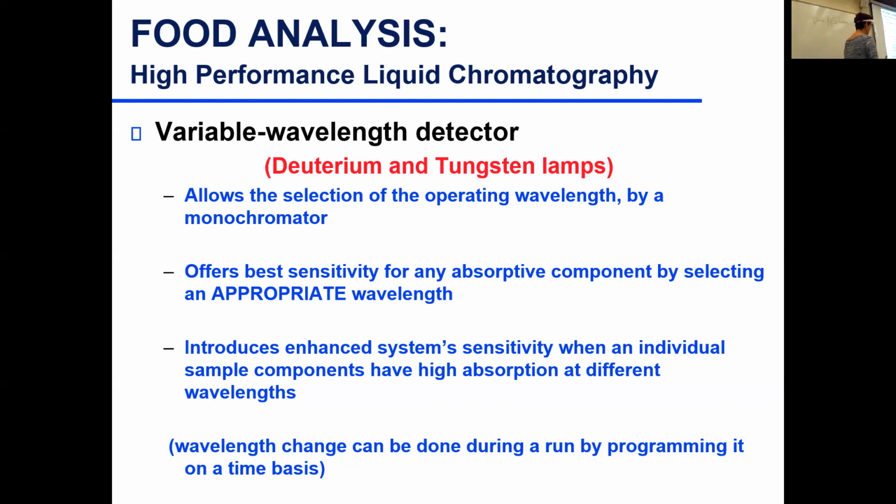You can also program it to detect at different wavelengths at different time points, because the slit opening moves and allows different wavelengths to pass through. But you cannot make more than two adjustments usually with such detectors. So it's limited, but it is a widely used detector.